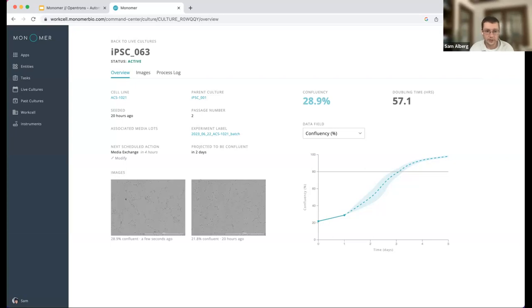We have another question here. Have we integrated this for cell-based gene expression analysis? The short answer is that's on our roadmap. We're working with some customers now to expand some of the workflows we support from beyond just cell culture and actually doing more cell line development. We anticipate it's all possible. It's just not something that we've done quite yet. One of our customers does use the flow cytometer to stain, with specific stains, to understand gene expression of CAR T cells, from my understanding. Thanks, Kari.